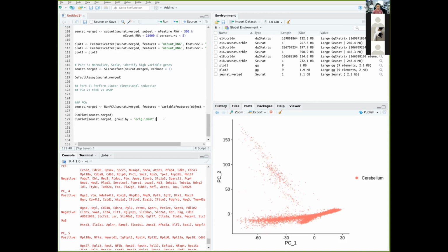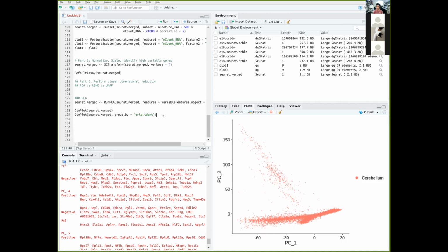Okay, thank you. Good you pointed that out, because I wouldn't pick that out if I were to run this on my own. And the plot is correct. Just that you didn't think they would change the scale like that. Cool. Thanks.